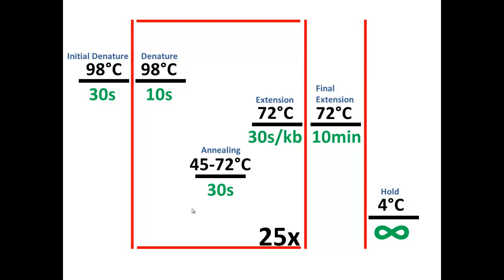The other variable point is the extension time. Now do not overlook this. For example, amplifying a plasmid will take a much longer time than a 700 base pair fragment. Generally you want to go 30 seconds for every thousand nucleotides. Alrighty then, let's go ahead and now look at some scenarios for troubleshooting.